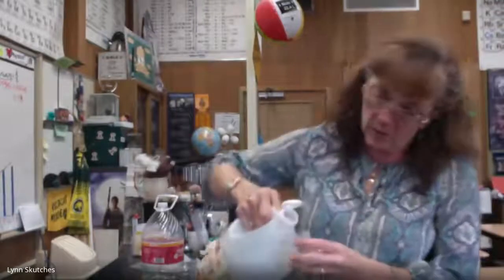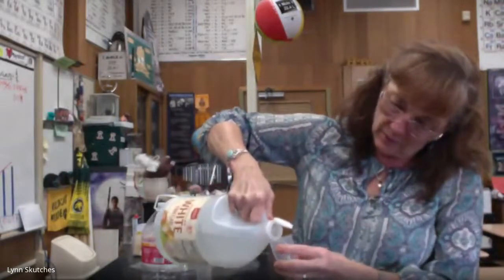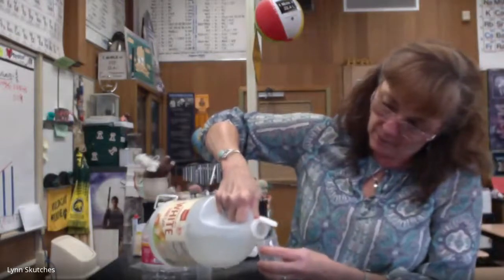So the last one is, use your 50 milliliter vessel to get the vinegar. It doesn't have to be exact, okay? I will measure and get masses on.